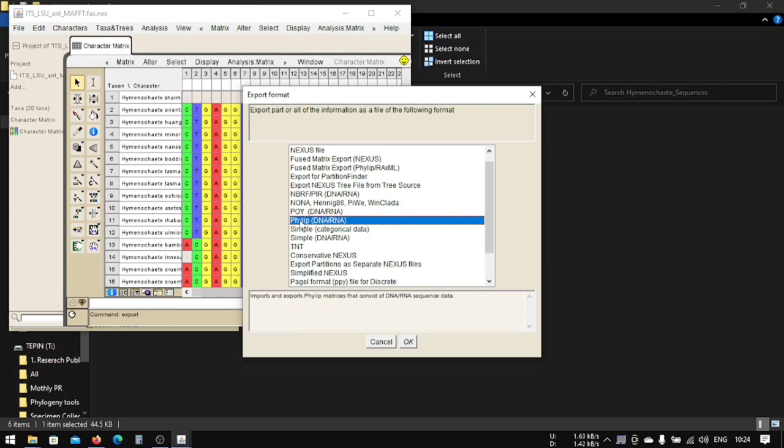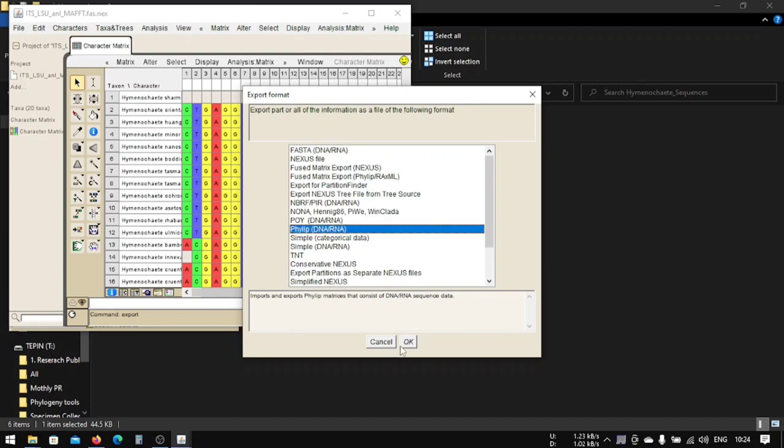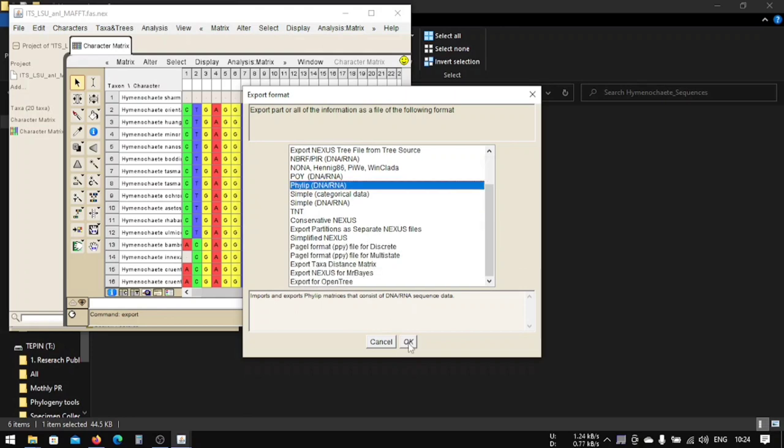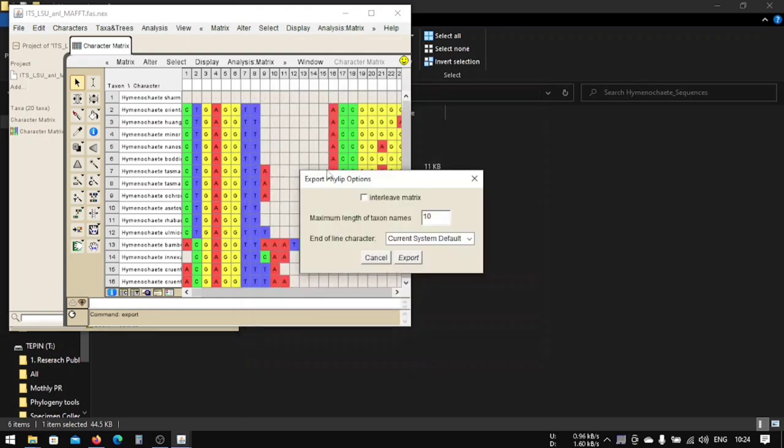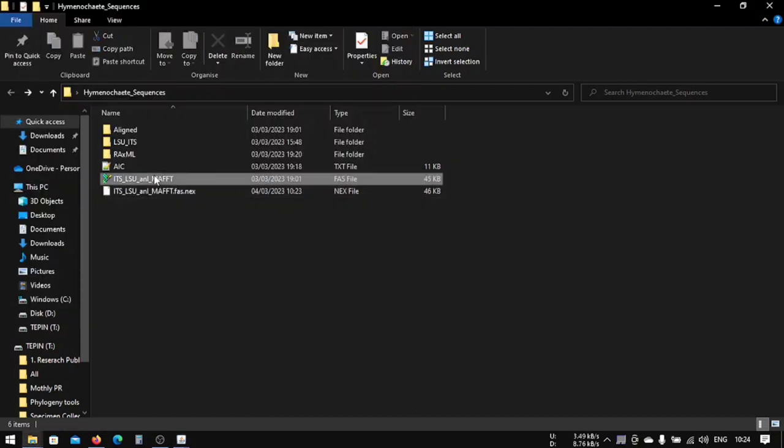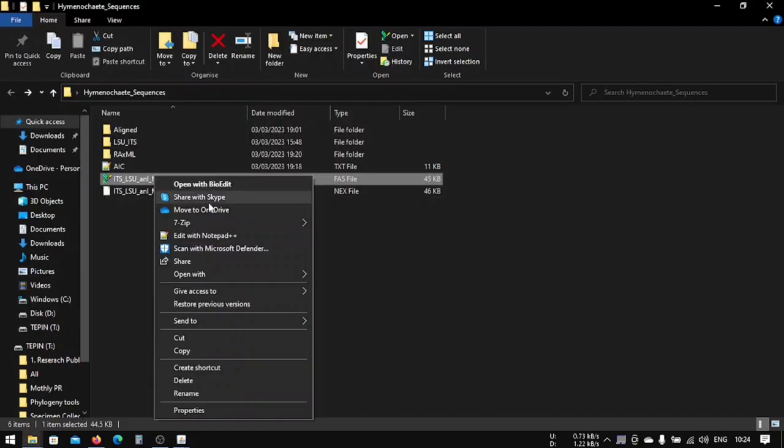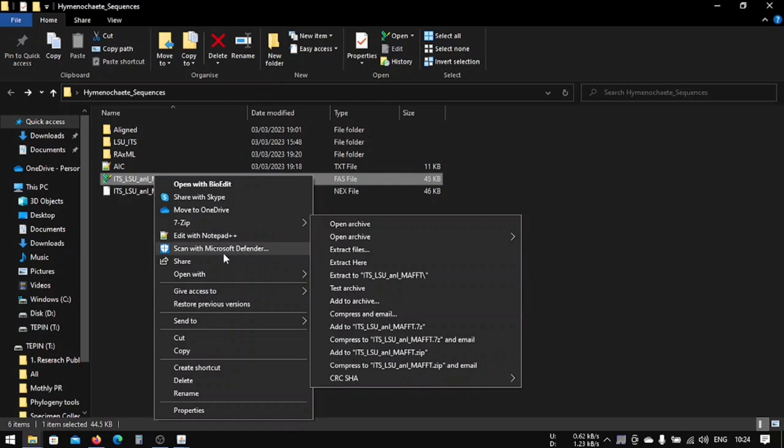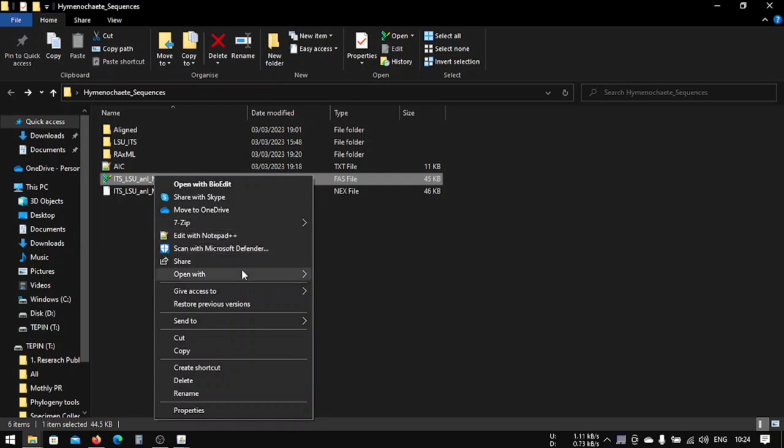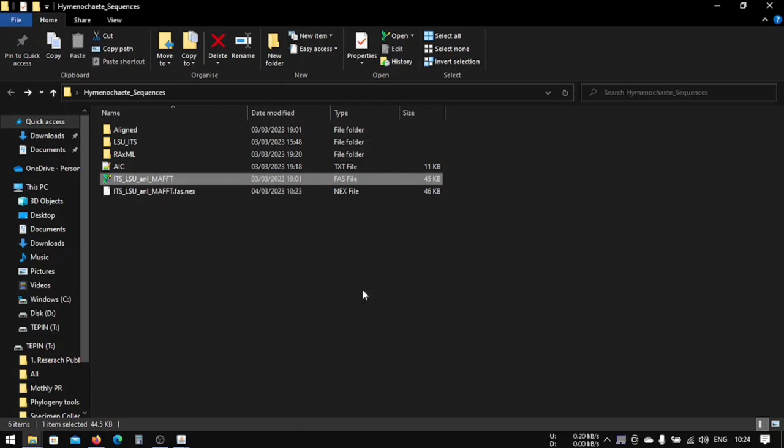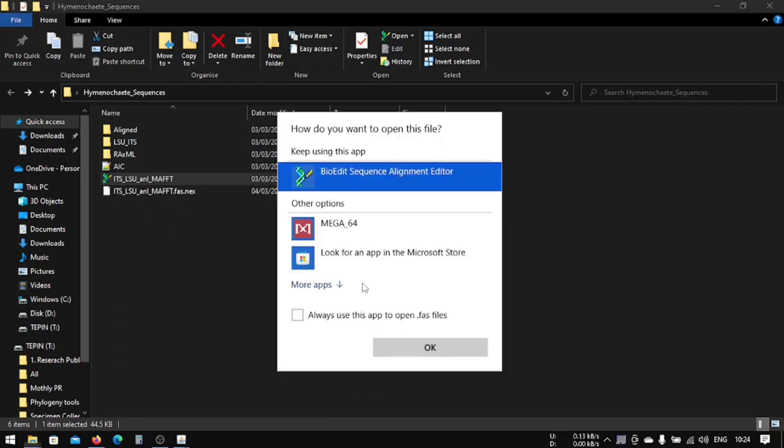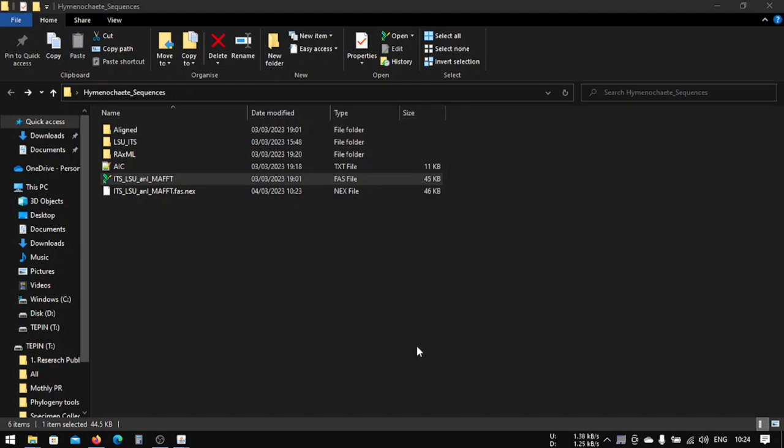That is our phylip file here. Since our sequence is DNA, we will choose this phylip DNA and RNA. Now we will press OK, and it will ask the length of our taxon name. We can also check it from here. Open with BioEdit.